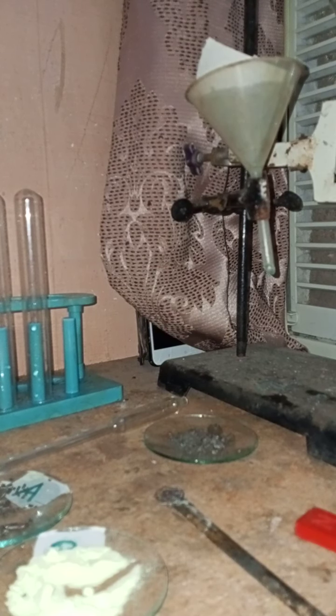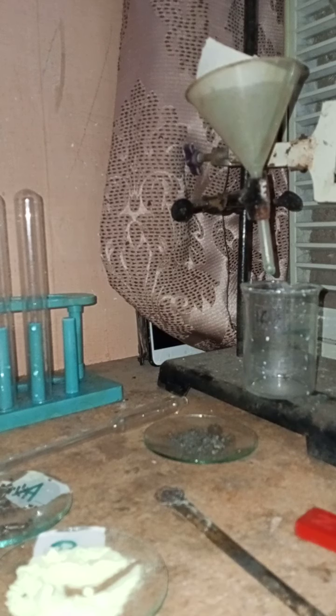Now we are going to mix both of these materials present in the watch glasses. So I am going to add sulfur powder to some of the iron fillings. You can see here these are the iron fillings.